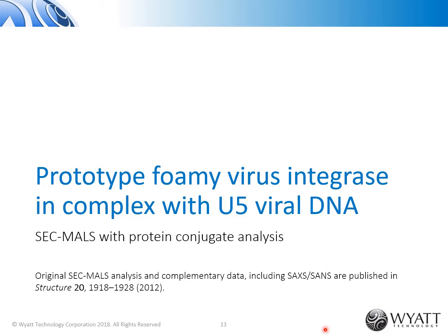Now let's look at how to apply this SEC-MALS and protein conjugate analysis to a protein DNA complex. This example looks at the prototype foamy virus integrase, or PFV integrase, in complex with some viral DNA. The original data, along with complete structural information, was previously published by this group at the University of Pennsylvania.